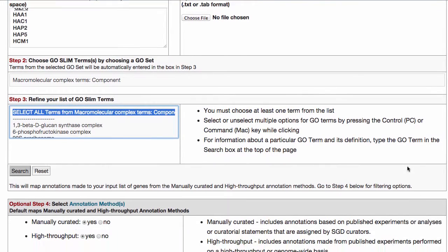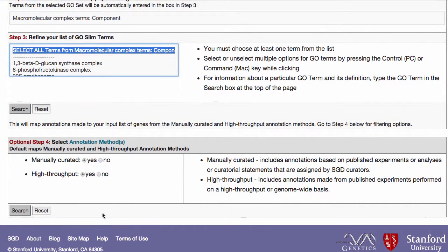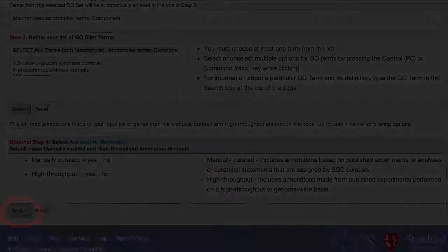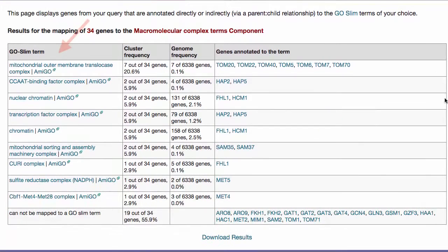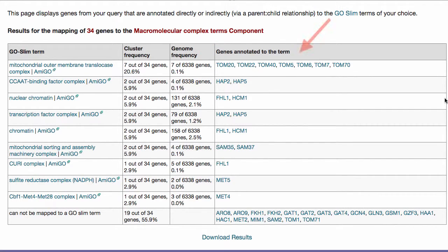Once you have made all your selections in Steps 1, 2, and 3, you're ready to go. Just click on the Search button to see your results. The results table lists matching term names, the number of genes in the query list that map to each term, the number of genes in the entire yeast genome that map to each matching term, and a list of genes in your original query list that map to each term.